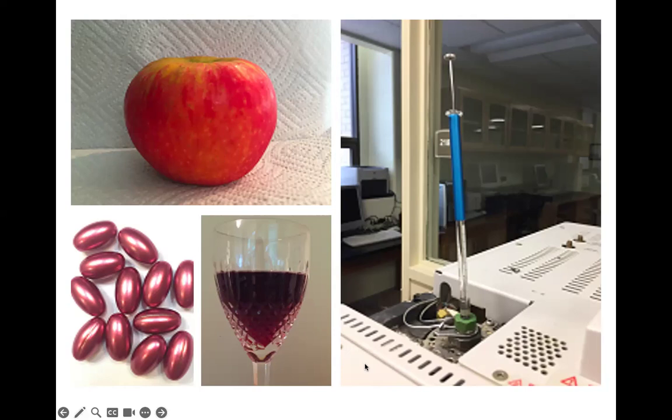For example, pre-concentration. What does it mean by pre-concentration? It is to increase the concentration of the analytes that you wish to measure. For example, let's say, I'm not sure whether this is coffee, probably, okay, just pretend that this is coffee beans, okay? And you are to analyze the amount of caffeine in these coffee beans, okay? Probably you have samples of Arabica coffee and a few other types of coffee beans, and you are to analyze the caffeine.